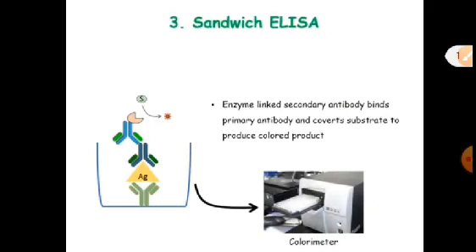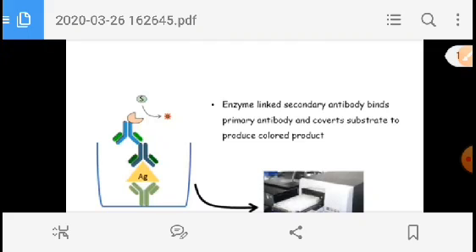It is applied in disease outbreaks, tracking the spread of disease. It is used to detect various kinds of diseases. ELISA is also used in vitro diagnosis in medical laboratories. So this is about the ELISA test.